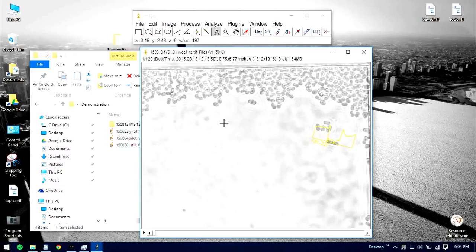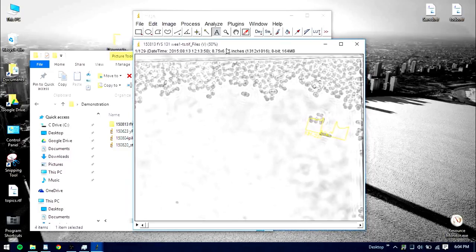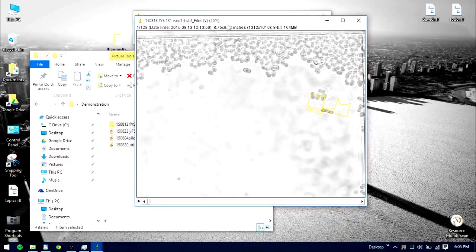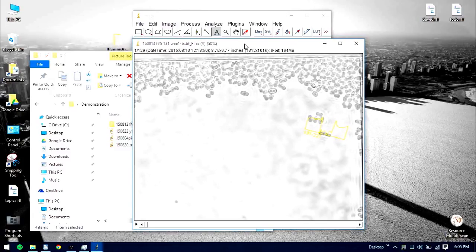So there's no real need to have it in color or anything very much above 8-bit, because when you have those sorts of colors, it just makes the analysis more difficult. I'm sure that this could vary by the sort of file that you're analyzing, but in my experience it's been simpler to do it in 8-bit.